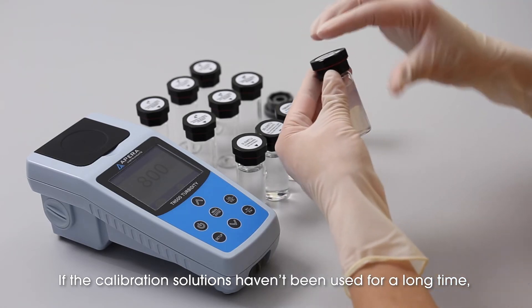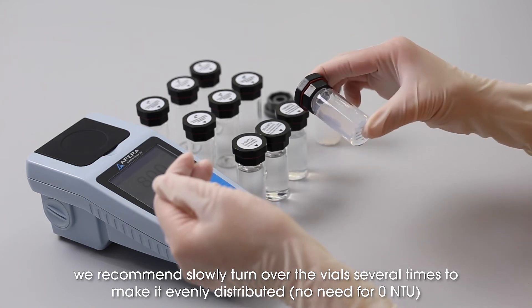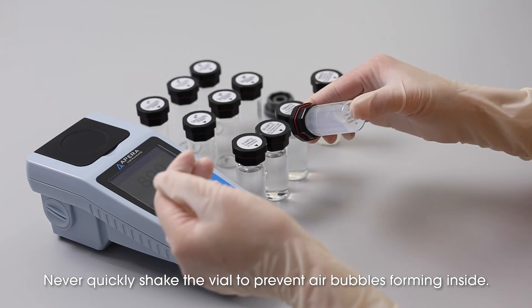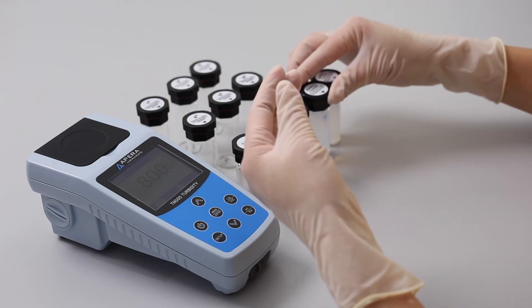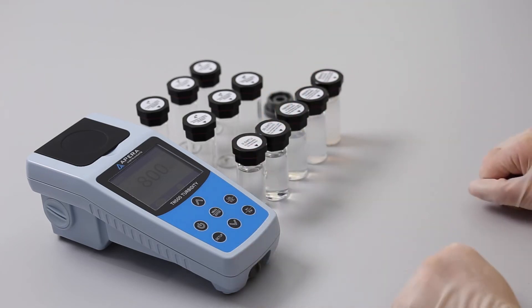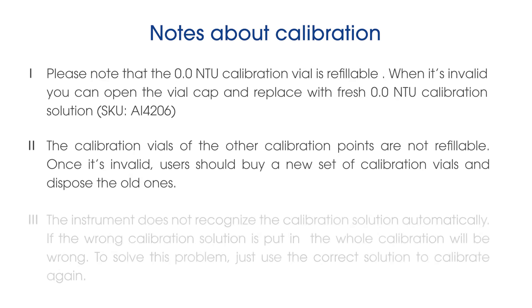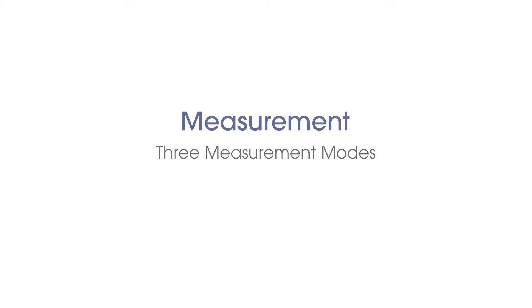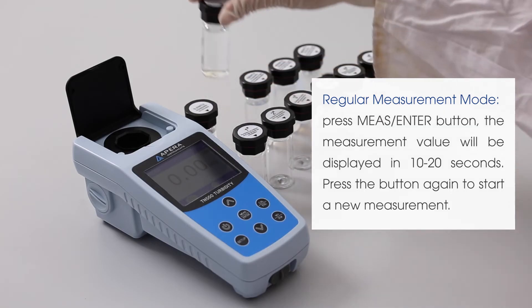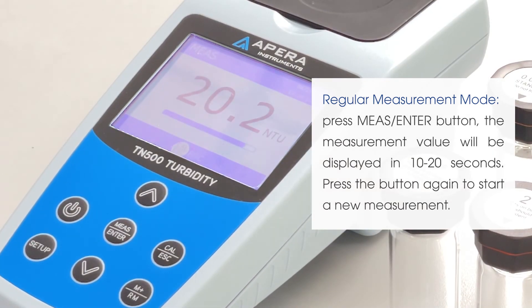If the calibration solutions haven't been used for a long time, we recommend slowly turning over the vial several times to make it evenly distributed. Never quickly shake the vial to prevent air bubbles from forming inside.